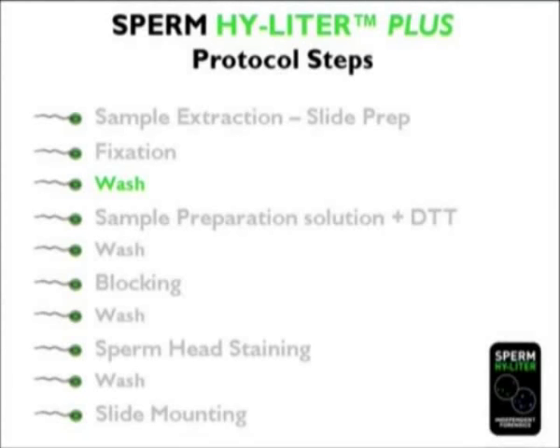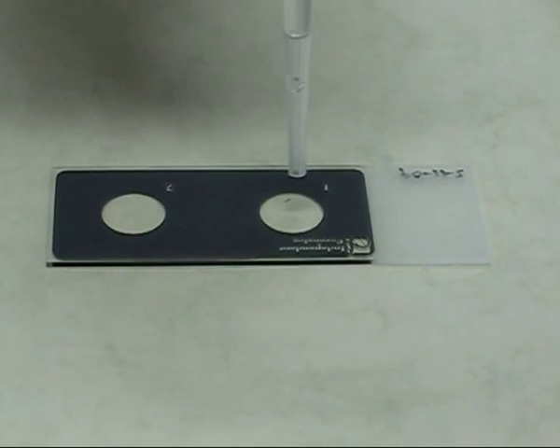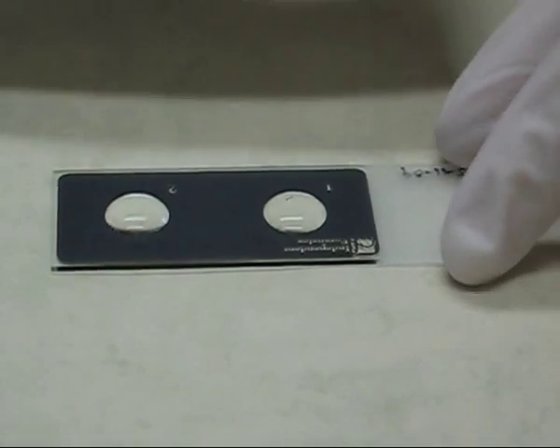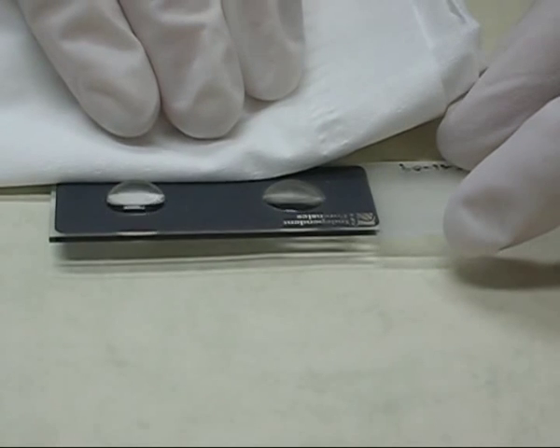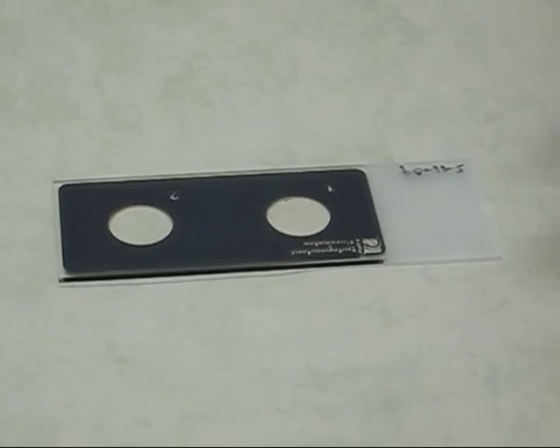After the fixation step is complete, the fixative is rinsed from the sample window using the provided Sperm Highlighter wash solution. Vigorous washing is neither required nor recommended. Wash solution is provided as a 10x stock that must be diluted with water prior to use.